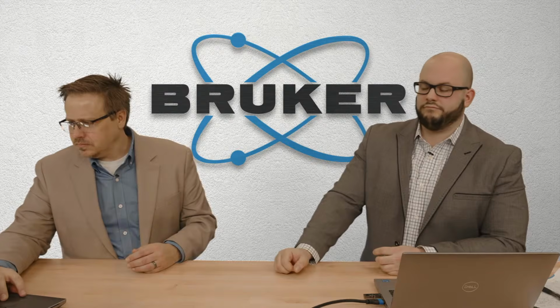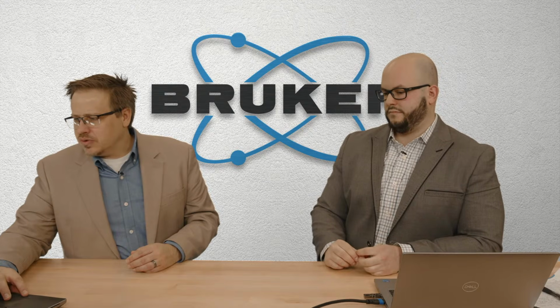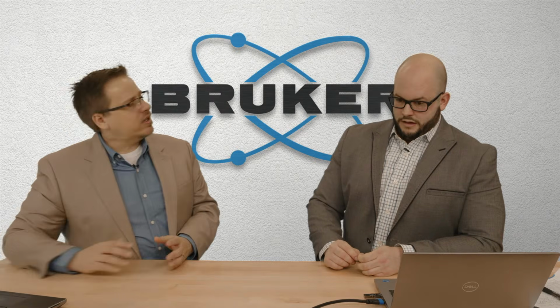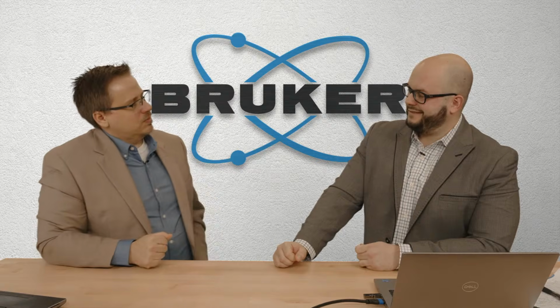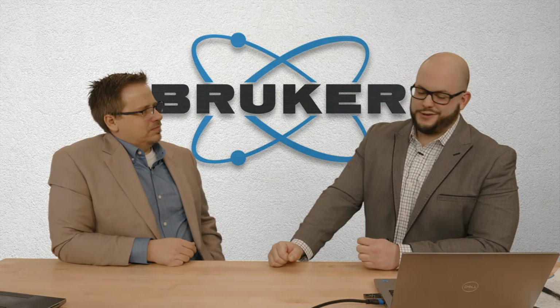So. All right, also from Akshay, when you use a 2D detector instead of a 1D detector for the same data quality, how much will be the reduction in the measurement time? All right, so let's assume that we have a nice sample, powder-like ring, so we can do side inclination, right, with the 2D. Yeah. What do you think? What's our time saving? I don't know a number off the top of my head, right? Because every situation is going to be different.